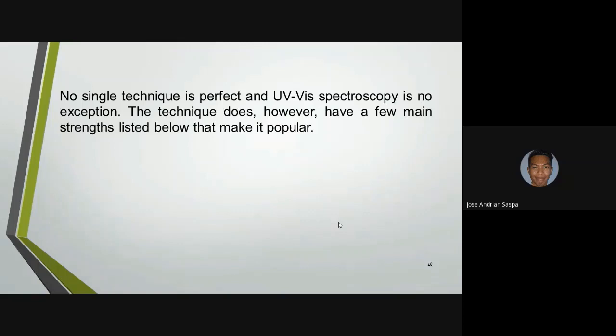It could be that the result is not good enough due to other factors. So UV-vis spectroscopy is not that perfect an instrument.